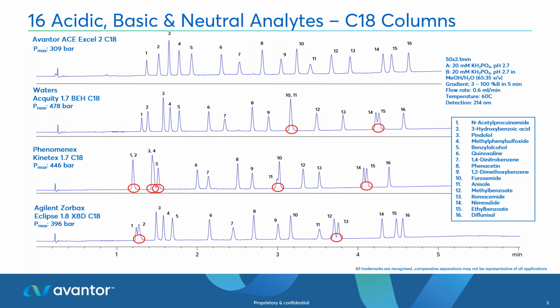And in terms of what we'll get from those columns is a hydrophobic mechanism of interaction. So our hydrophobic analytes are retained on a hydrophobic stationary phase. Now, not all C18 columns are exactly the same, but in terms of their retention mechanism, they're all utilizing hydrophobicity. So you've got a long alkyl chain that is the only mechanism, or should be, if you've got a high purity stationary phase, that should be the only mechanism that can interact with your analytes.